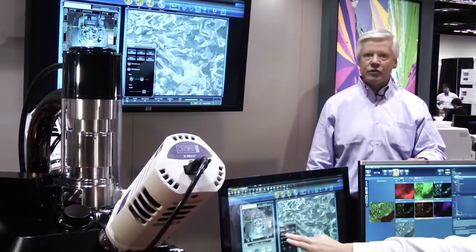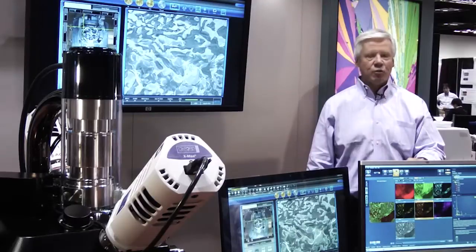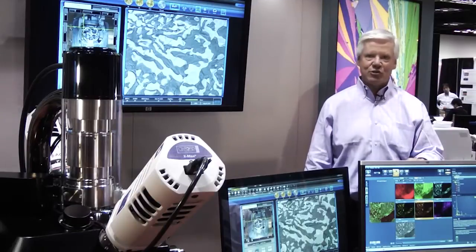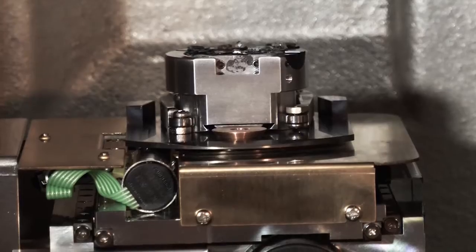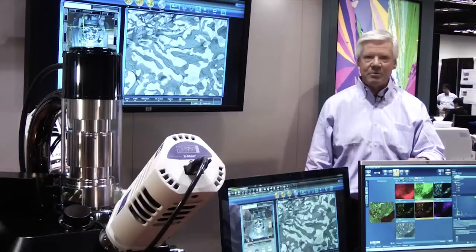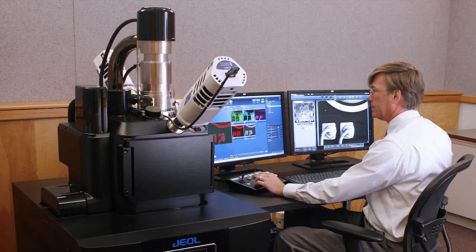The new specimen chamber design allows for those two detectors to be at 180 degrees opposed. In the real world, we'd love to have all of our samples be flat, polished, and homogeneous — but that is not the real world. So this allows us to do x-ray analysis on the microscopic scale on samples that are truly rough, irregular, and non-homogeneous.